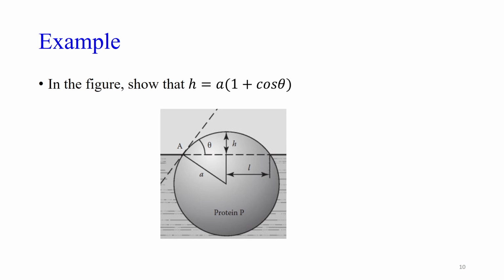So, here I have listed one more example. As I was telling, if you can fit the imaginary circle like this, experimentally by analyzing the image, you know this is the height h, this length is L, and A is the radius. So, this will be A minus h. Now, the angle of tangent should be equal to the interior opposite angle. So, this angle is theta.